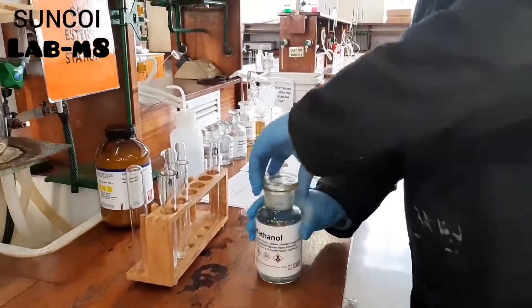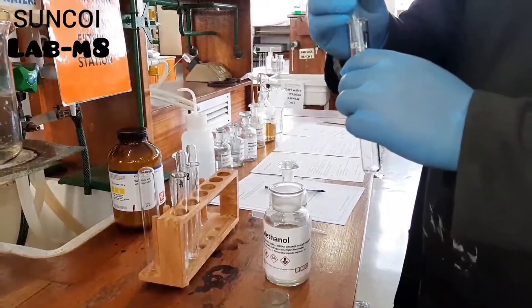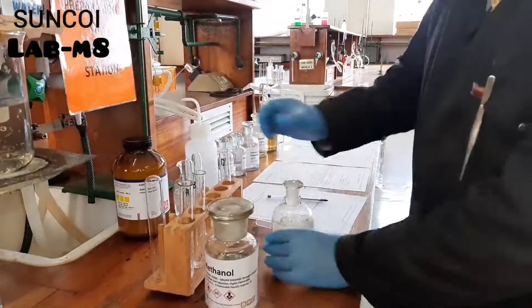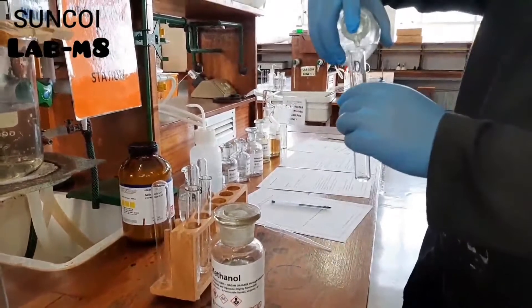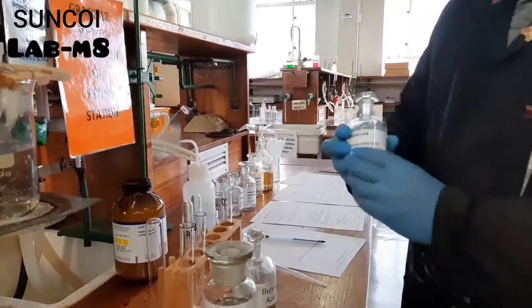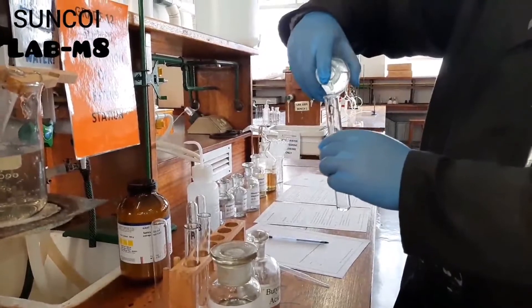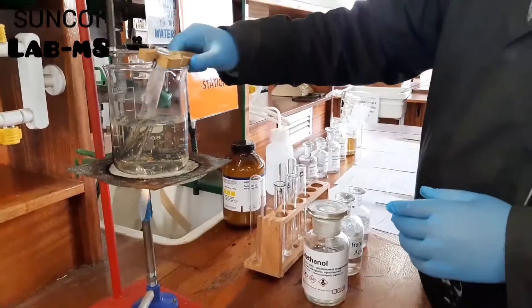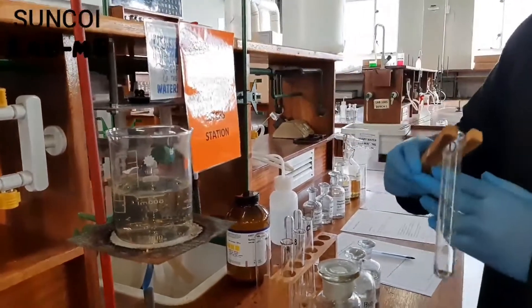For experiment D, you're adding a few drops of methanol to your test tube, then a few drops of very smelly butanoic acid — it smells terrible. Then one drop of concentrated sulfuric acid. Into the water bath, and after three minutes you add your distilled water.